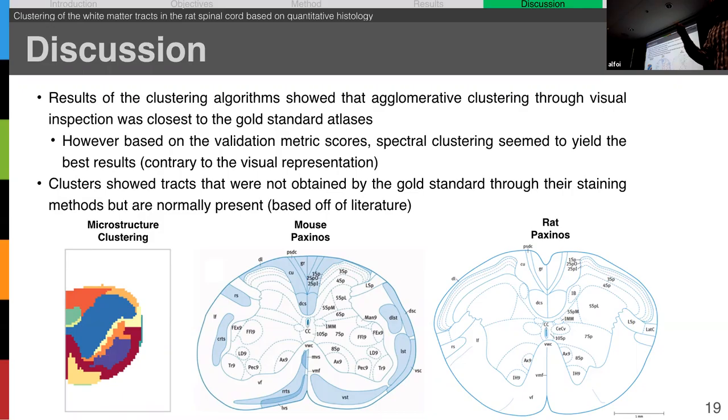Okay, so it's an interactive tool. Exactly. There's a bit more of a UI. With that one, as opposed to the machine learning based one, which is all automatic, you just have to specify your inputs, what kind of data you're inputting. So it's just trained on that. I think it uses SEM and TEM, I believe, but I'm not sure for the machine learning one. SEM for sure, because we looked at that later on, and it's one of the main image modalities that we use for scanning. So you just put in the modality, put in your pixel size, and then it'll compute the segmentation.